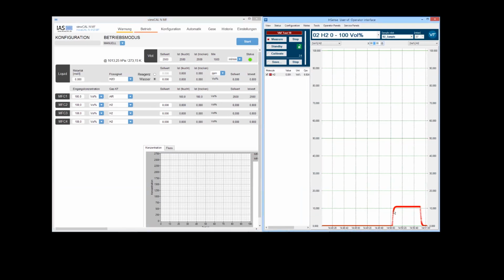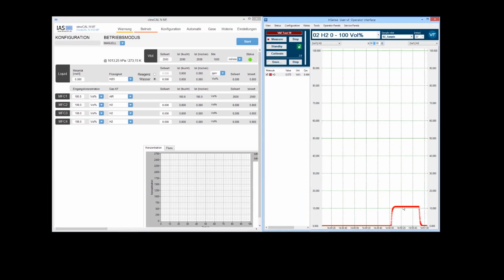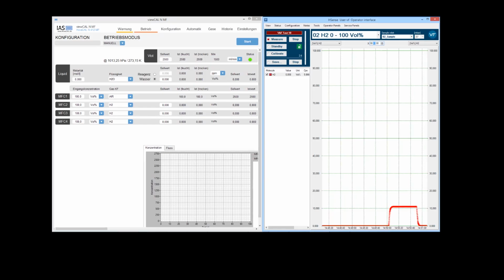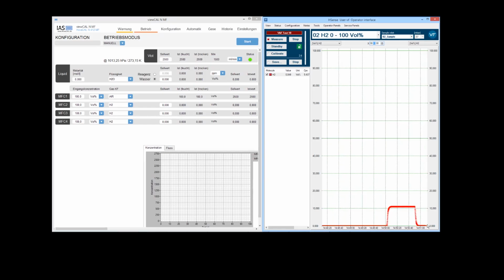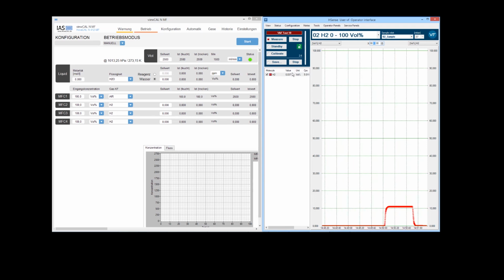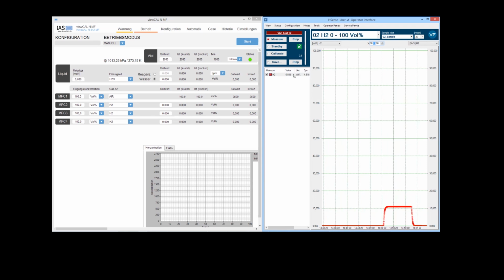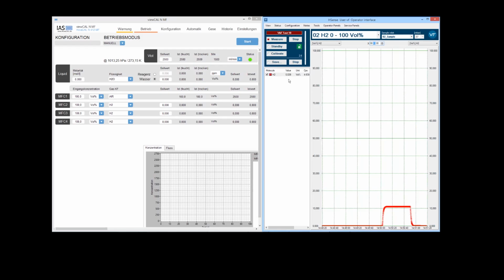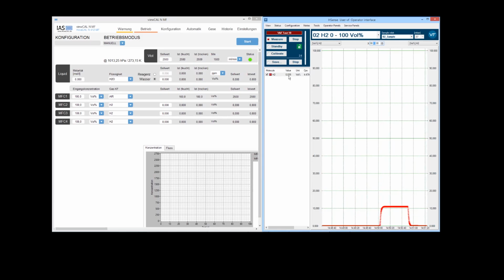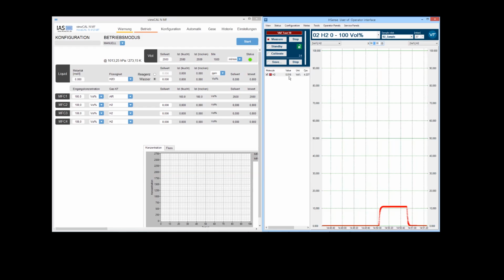As we see here, since we are using an HSense with a gas cooler, we need to give the instrument some time for the signal to saturate. This can be easily checked by directly looking at the currently displayed value. So we see that we are approaching the 0 value quite nicely.